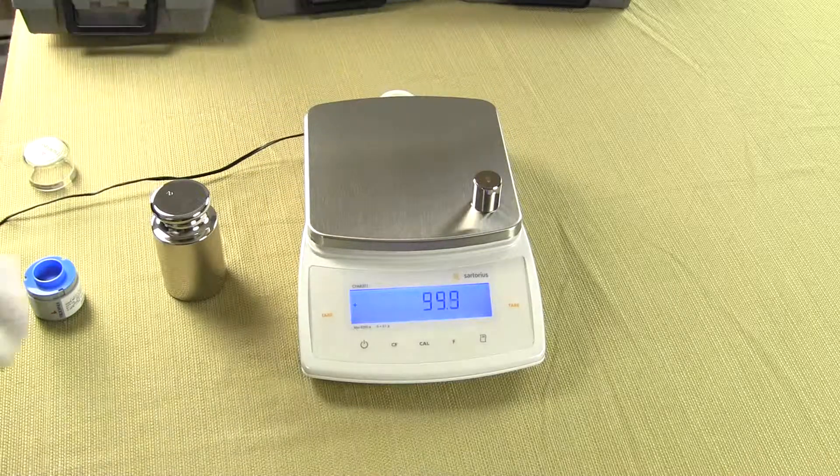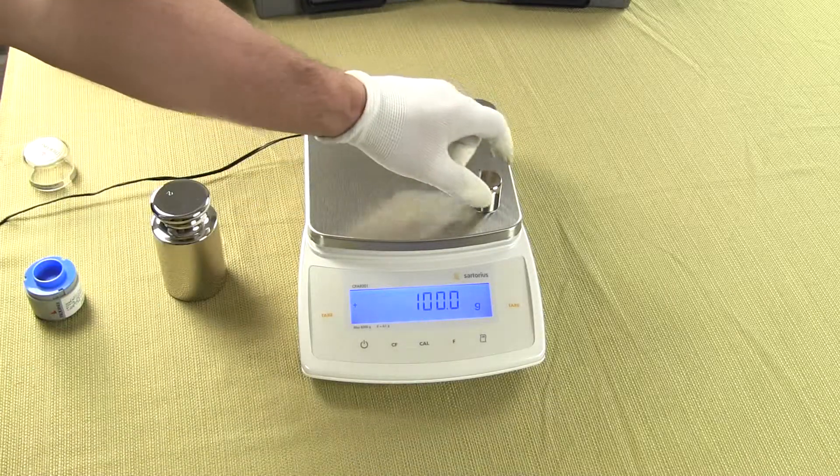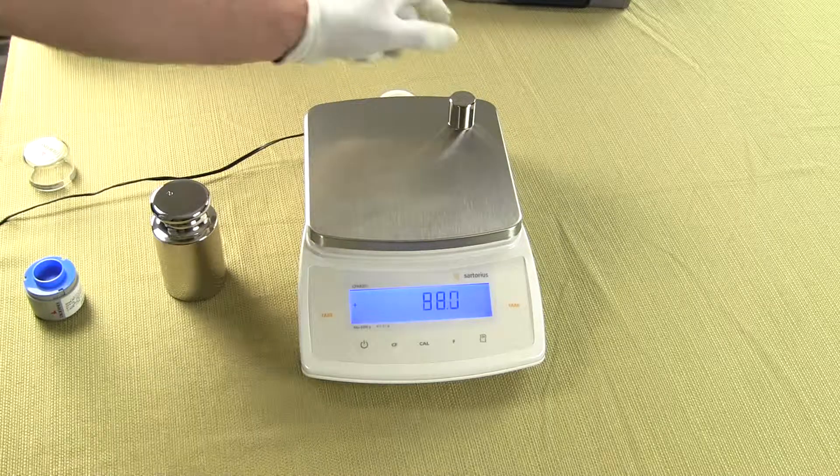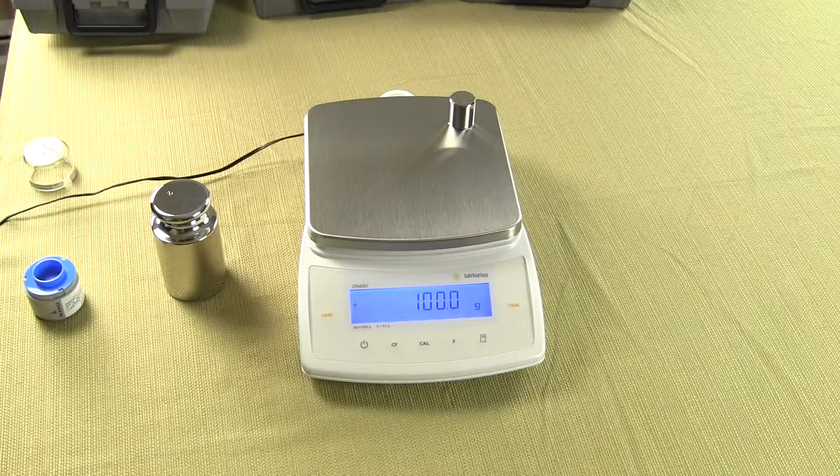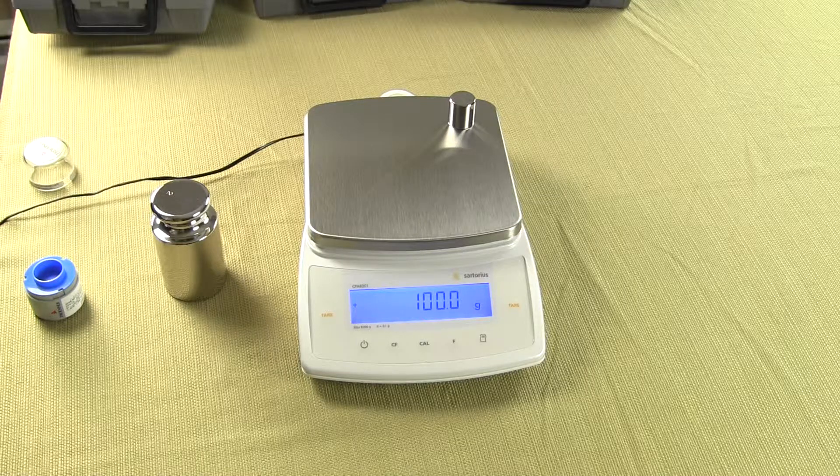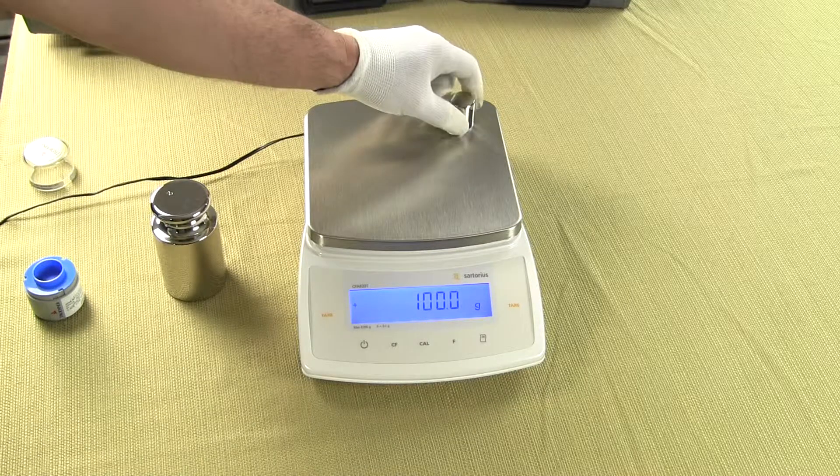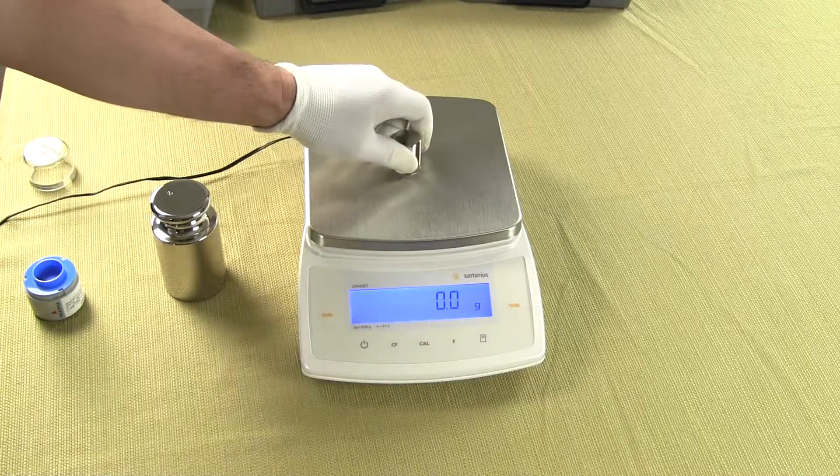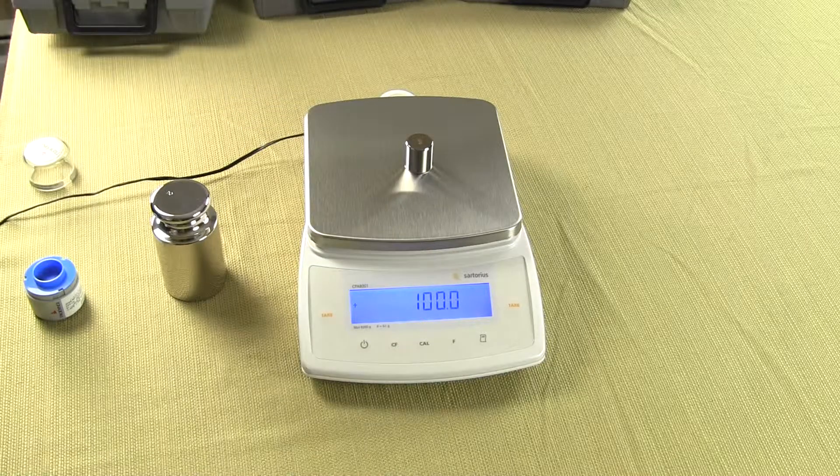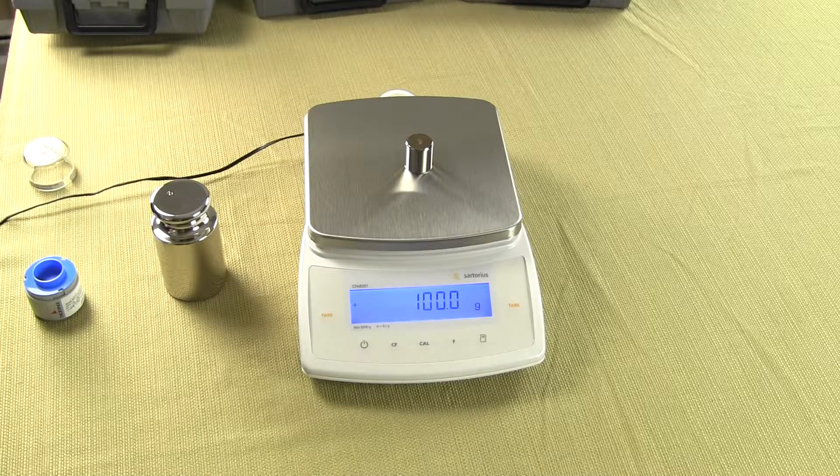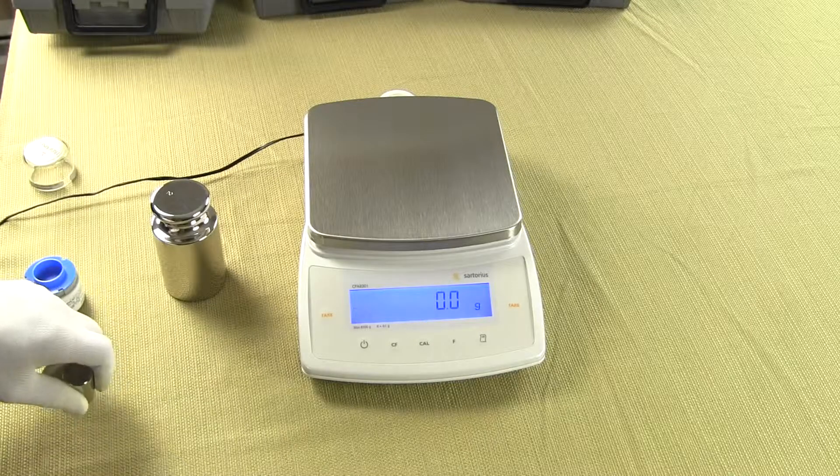So you'll notice when I put the weight on all four corners the balance is right on the money and you'll see how fast the response time is. If you bought a balance from another company, a no-name brand, put a weight on it and you'll see the balance start to drift all over the place. You don't see that with Sartorius.